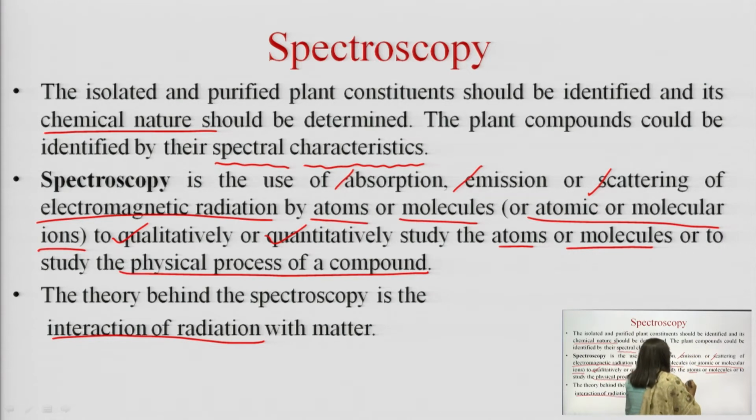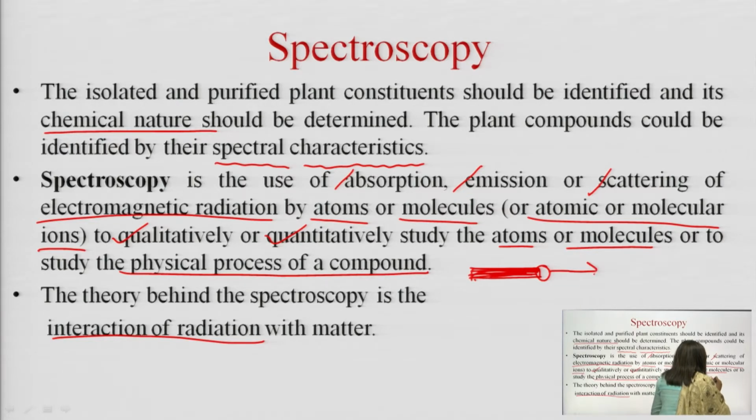I must mention that absorption says that the light entering the sample has a certain energy level, and once it enters the sample, while leaving, some amount of energy is absorbed, leaving behind a thin trail. In case of emission, the light entering the sample would start emitting at a slightly higher energy level.